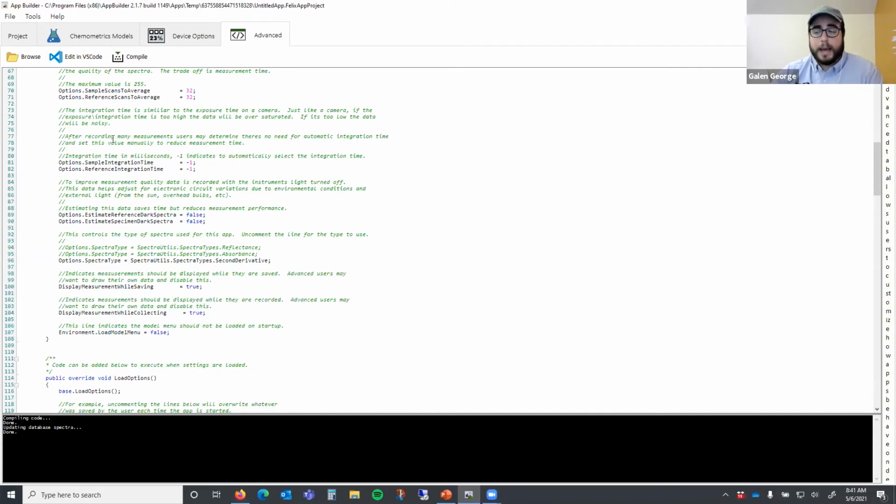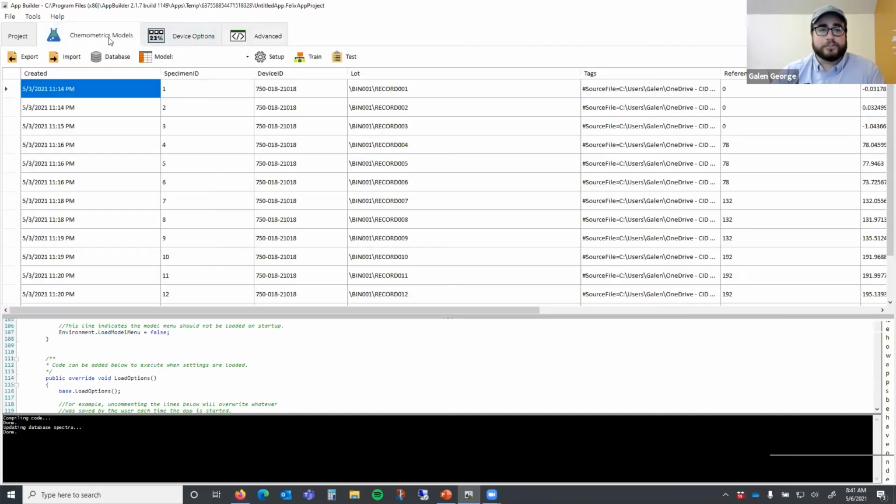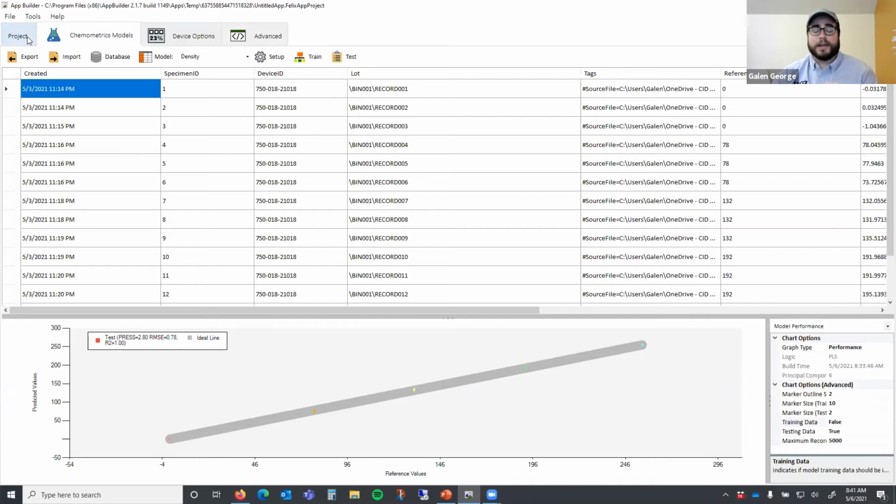So that is AppBuilder in a nutshell. We have other tutorial videos explaining things, including a walkthrough of how to create an app. So if you do need more assistance with it, please consult the tutorial videos, as well as the manual, which has a pretty in-depth run-through of AppBuilder as well. And this video recording will also be available for any further review if you need it.